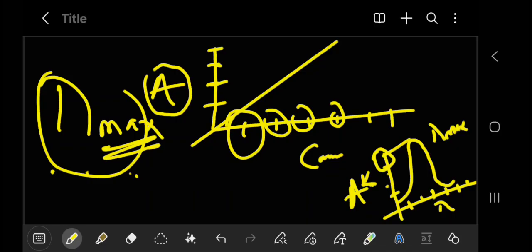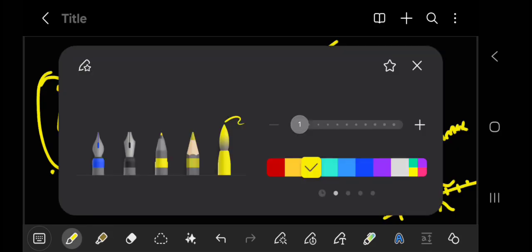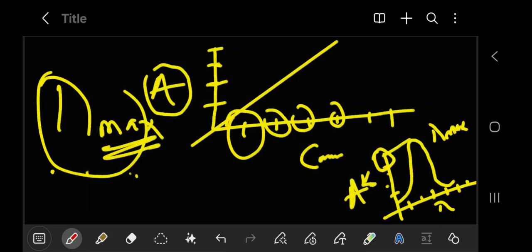Now it is that absorbance you would, in the second procedure, find here. Let me show you. If the absorbance was, let's say, 5 or thereabout, then you locate 5 based on the lambda max from the initial procedure.